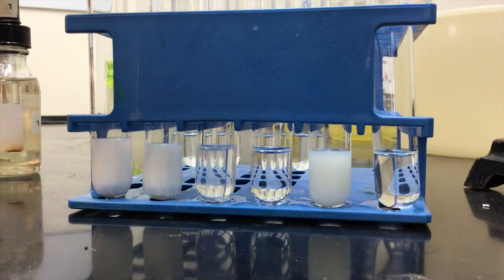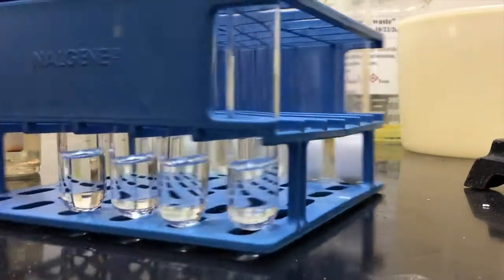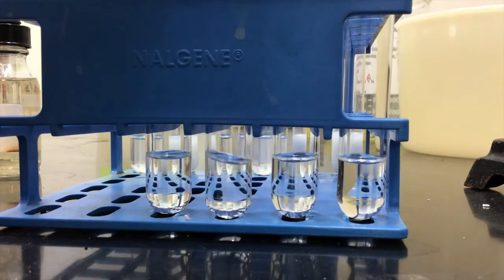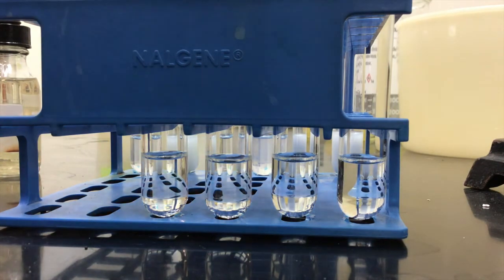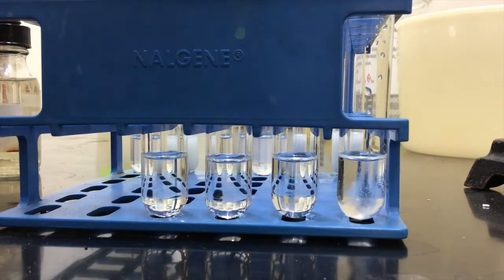All right, so we'll probably take a look at these when we come back, right before we start adding things to the heat. But here's number 7, 8, 9, and 10. Number 7 is benzyl chloride. What do you think? 1, 2, 3, 4 or so.